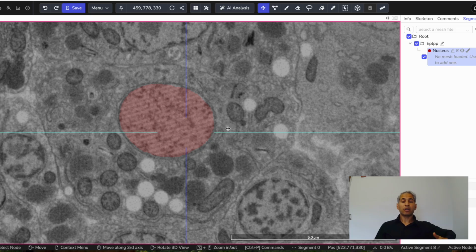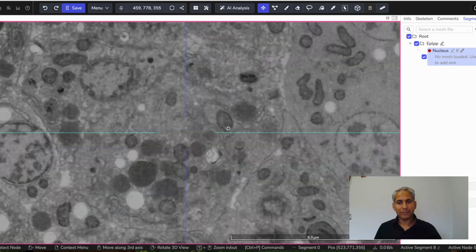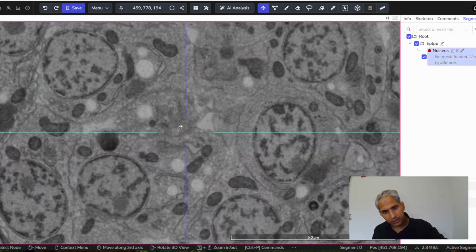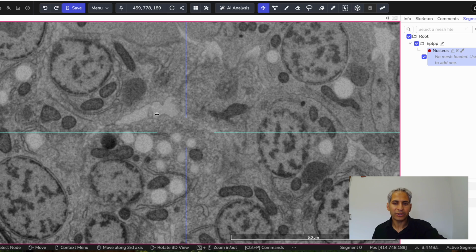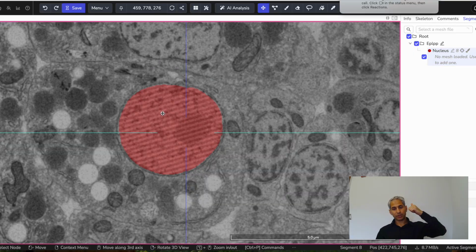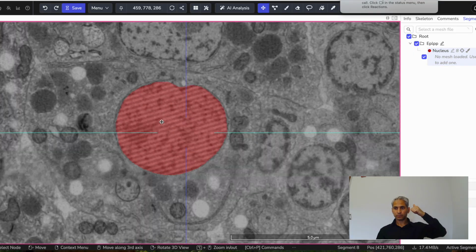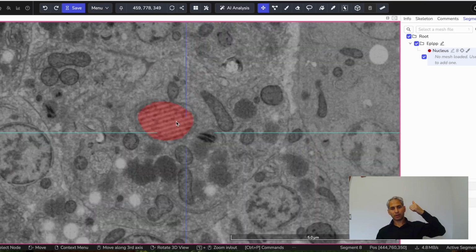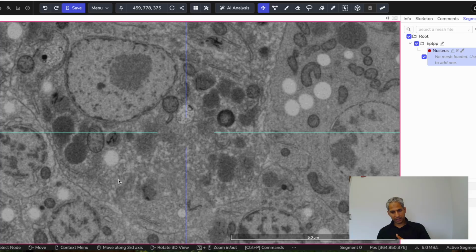To really get a good feeling of the boundaries of your cell, you have to go up and down, and sort of dive into the cell. Here I'm at the very bottom of my cell. Now it's going to disappear. And now there's a gap between its neighboring cells. But then I go up in the other direction, I enter my cell again. Here's my nucleus. And then I keep on going up until the other end of the cell.